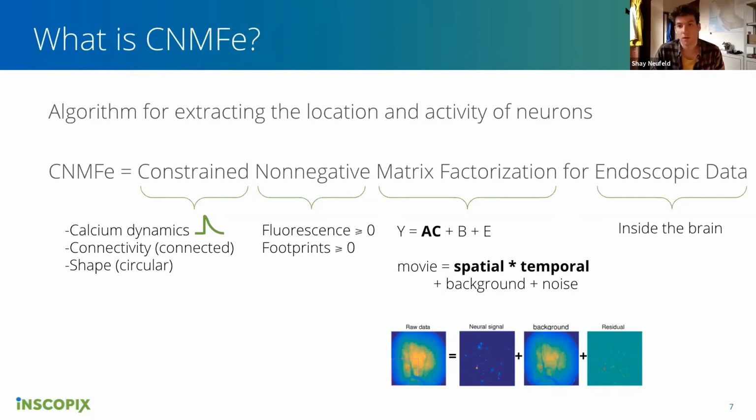So, that was the first time I've heard it, but knowing that, the same customer wants to use CNMFE in the GUI, because that was one of his complaints. I just want to make sure it'll work for his current setup.